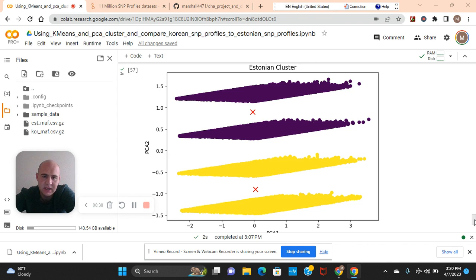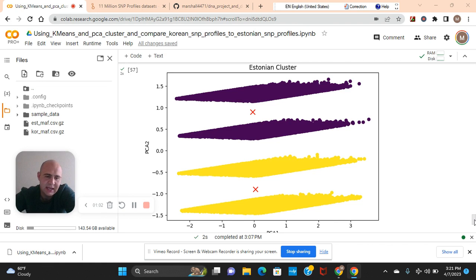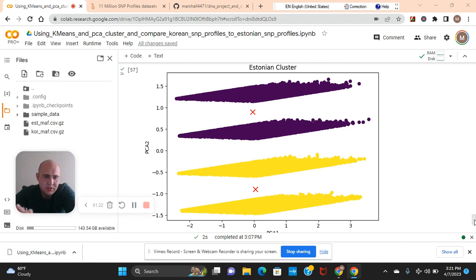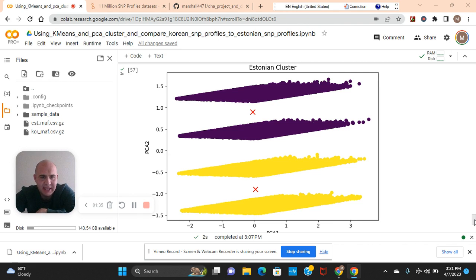These are SNP profiles of an Estonian person and a profile of Korean. The reason why I chose these two is because Asian people, East Asian and Central Asian people have some genetic similarities to Eastern European peoples, more the Slavic than the Baltic. However, Estonian is Baltic. That's because of Mongolian invasions and migrations a little bit. So it's not uncommon for them to have a little East Asian or Central Asian DNA. That's why I chose these two datasets.